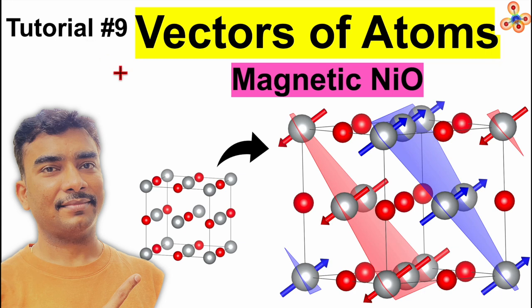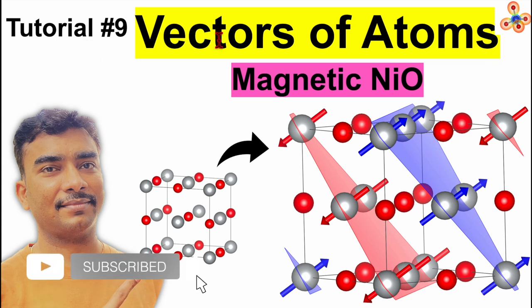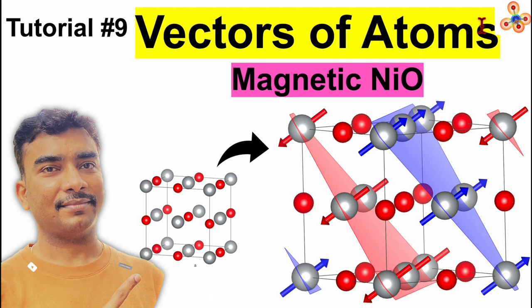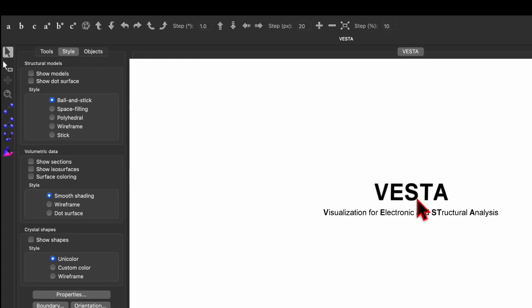In this tutorial number nine, I want to show how to visualize or create a vector for an atom with the VESTA software. We will consider the example of magnetic nickel oxide, which shows antiferromagnetic properties. Open the VESTA software, then go to the file and click on open.